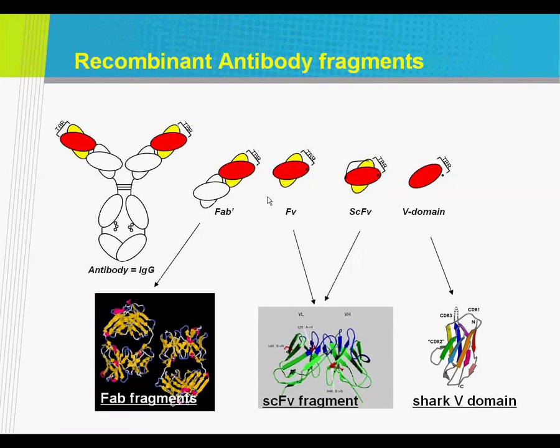Most of the time when we express these proteins and antibody fragments, we would have a tag at the C-terminus of these fragments. Most of the time it would be a His tag, or we would use a FLAG tag. And we, in the past, have tried to capture these antibody fragments onto the chip surface. So in this case, we had anti-His tag antibodies on the surface.